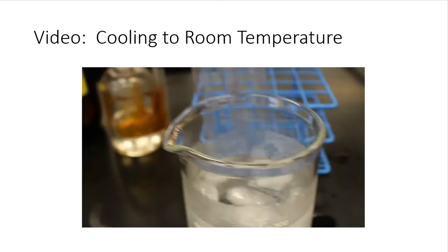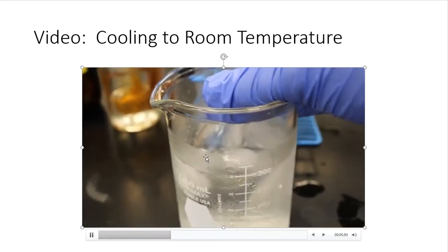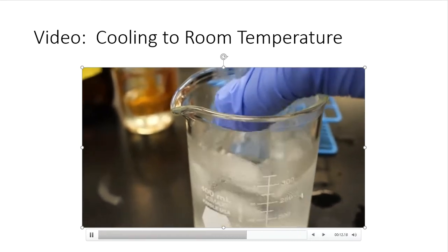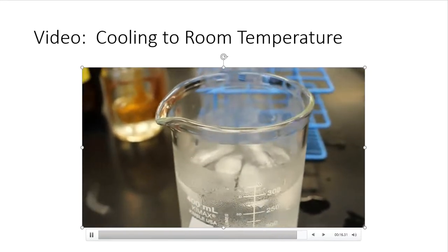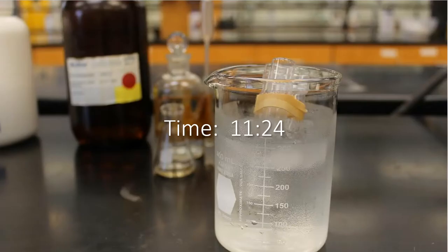All right, so I'm cooling it to room temperature here at this point. It did generate a little bit of heat on me after I dissolved it. So I just want to make sure that everything is at room temperature before I go forward. So on the hot plate, they've dissolved. I've taken them off. I've let them cool to room temp before I go on to that next step that we just read together. So here the time is 11:24.